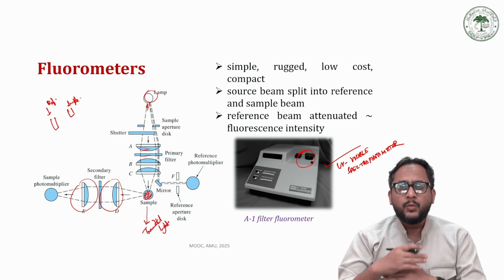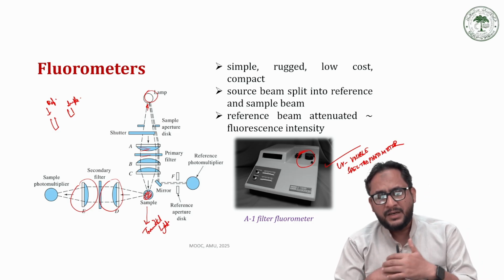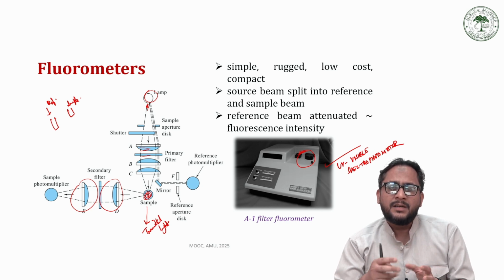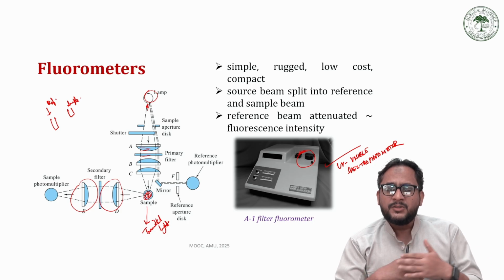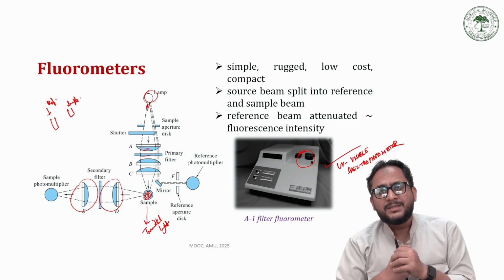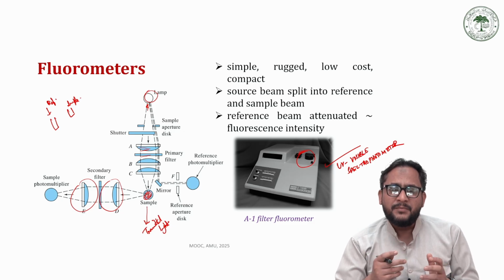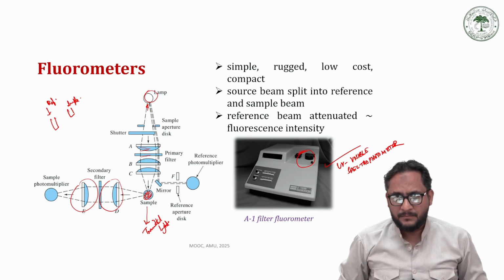In this way we compare the two spectra, for the reference as well as the sample, and if they are overlapping, superimposing each other, then we can say that the sample is actually the reference material, while if the spectra are different, we can say that the sample does not contain that particular molecule which is present in the reference material.